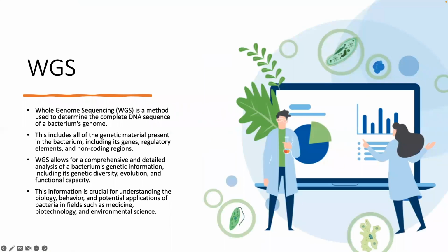So what is whole genome sequencing? Whole genome sequencing is a method to determine the complete DNA sequence of an organism. It is, for the most part, unbiased. When you go to sequence the whole genome of an organism, you're looking at everything. You're looking at the coding genic regions, the introns, the exons, the intergenic regions, any repetitive regions that might be in there, and regulatory elements as well. You're ostensibly going to see everything.